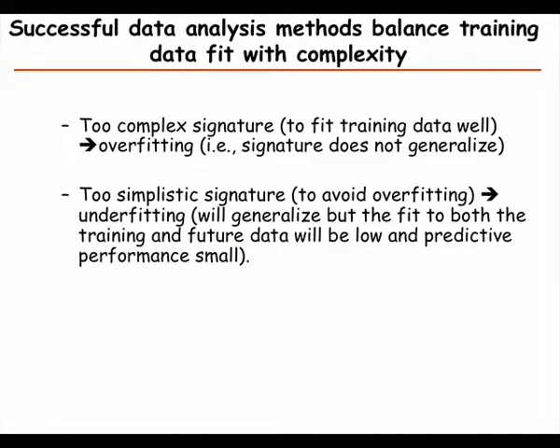So yeah, the main problem that we usually have is that our signature is too complex, meaning that it fits the training really well, too well, and that it doesn't generalize. But we do want to not have a too simplistic signature, because that's not good either.